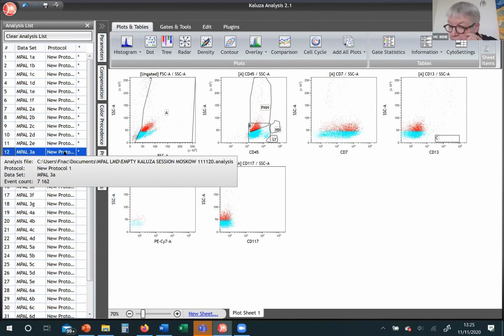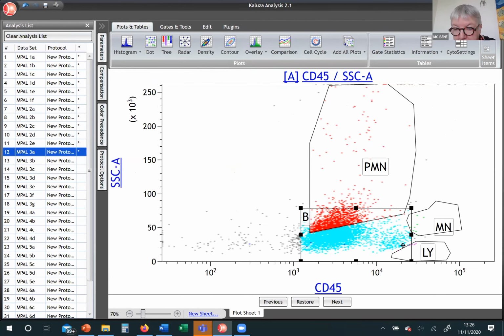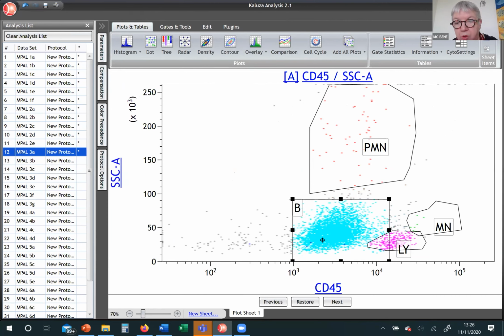Now we move to a third case. This one is also a man, 58 years old, and here's what we found. Again, quite a very neat population of blasts. These are diagnostic bone marrow, so as was said earlier on, it's always easier on the diagnostic. You don't have to prepare for the search of different-from-normal or LAIP. Here, it's not the same strategy. We're just trying to see if markers are co-expressed or not.